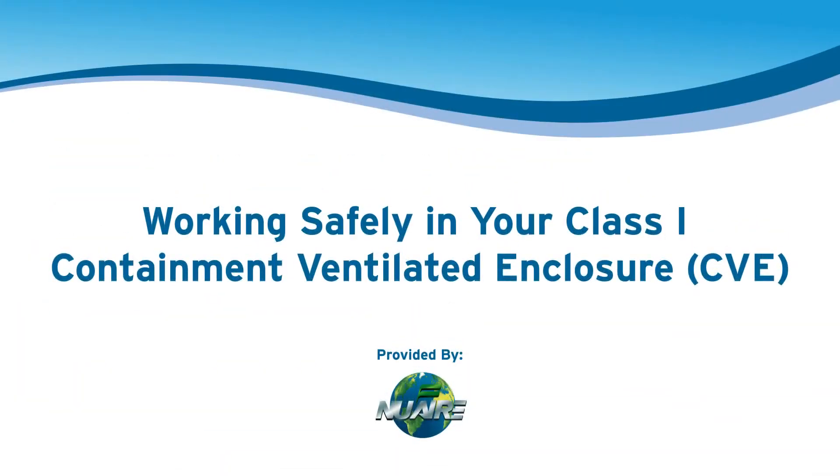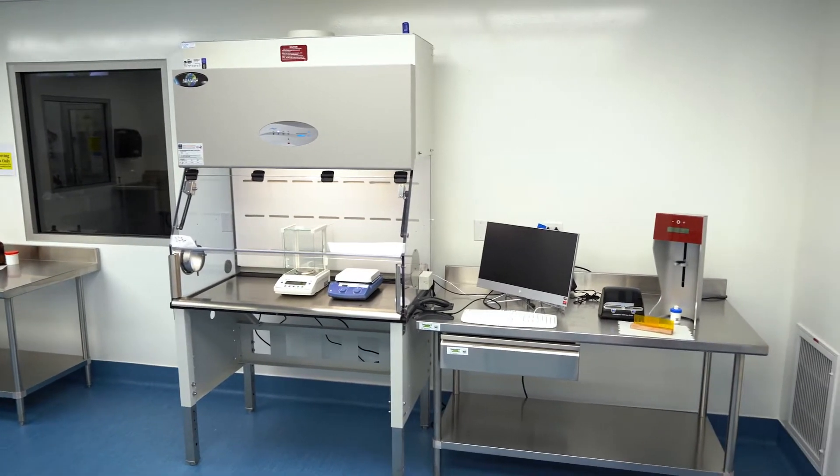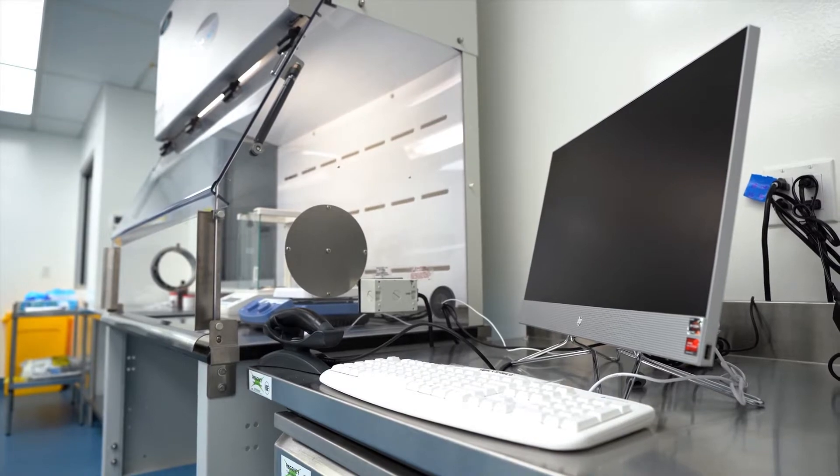In this video, we will be discussing the proper use of a containment ventilated enclosure and demonstrating best practices. Only properly trained personnel involved in preparation and dispensing of compounded preparations should be allowed into the lab space.